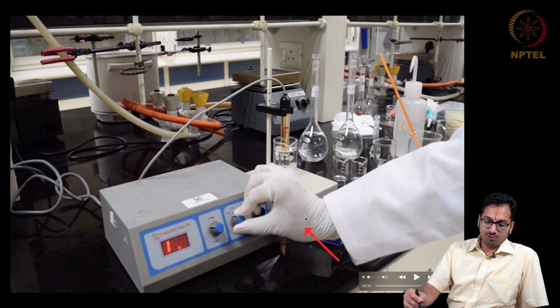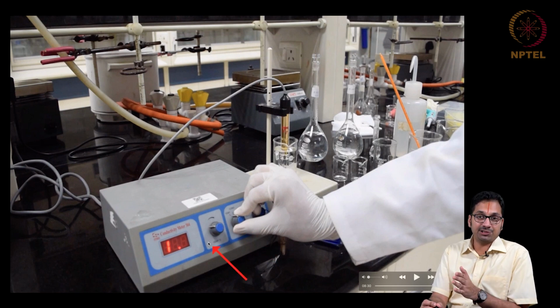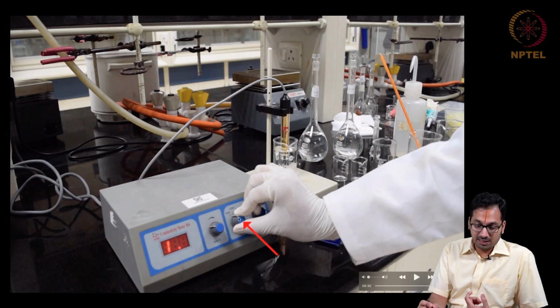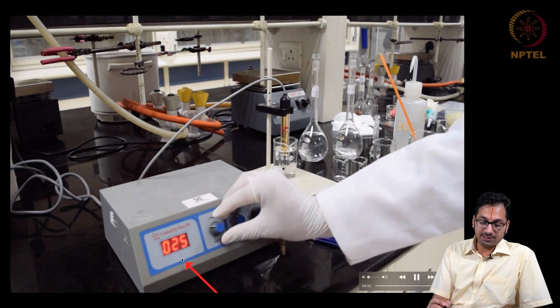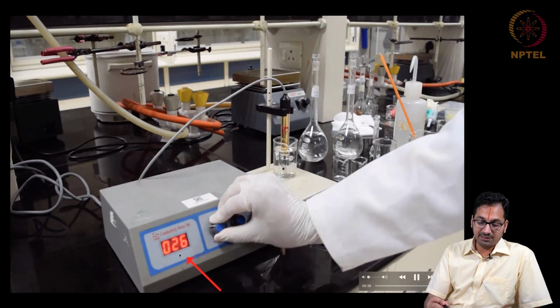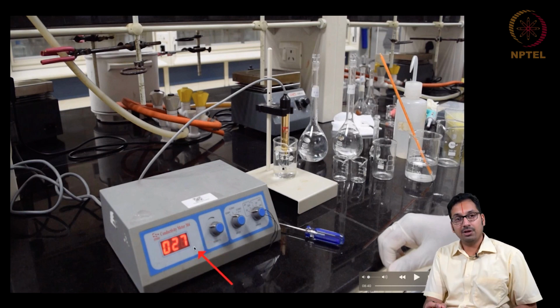What you are able to see the scientist doing here is that you are not able to read a conductance value here. This is how many meters work. They have their own ways of measuring things at different precision. If you are having very low conductance, one might have to carefully change the settings that go here. The first thing that one has to do is to tell the conductometer that you are going to be measuring at a certain temperature. The scientist is keeping it in the temperature column and reads the temperature that is 25 degrees Celsius, and whatever temperature has been measured using the thermometer is carefully adjusted here. Since we measured 27 degrees Celsius, the researcher first changes the temperature at which he is making the measurement.